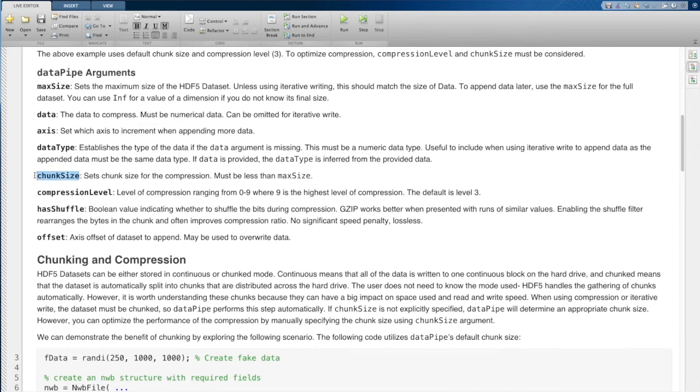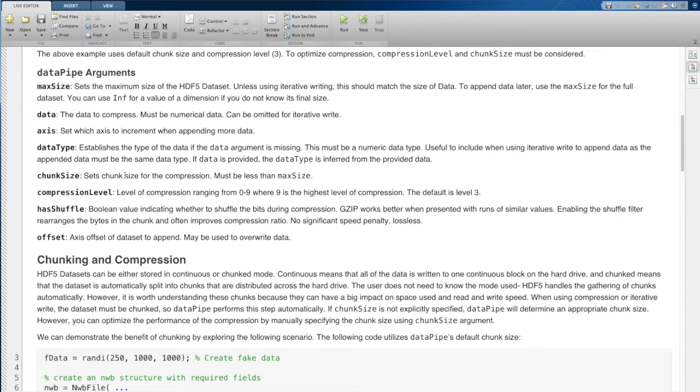The next argument is chunk size. Data sets can either be continuous or they can be chunked. If you're using data pipe, then you're either going to be using compression or iterative write. In both cases, you need to chunk the data set. So it's automatically going to be chunked. This option gives you the ability to set that chunk size.